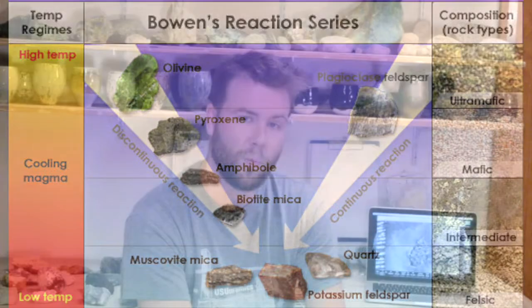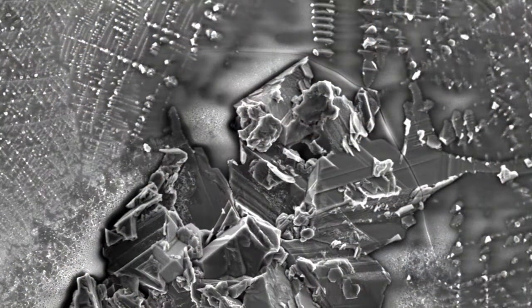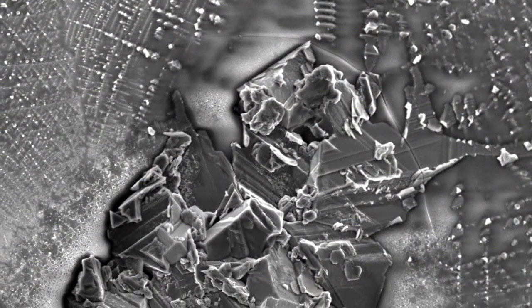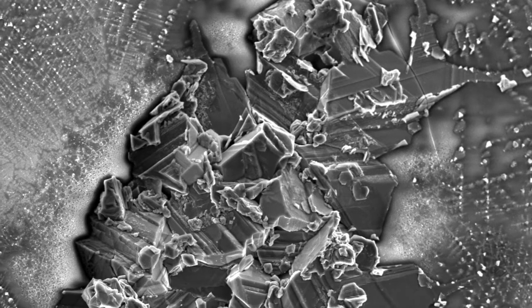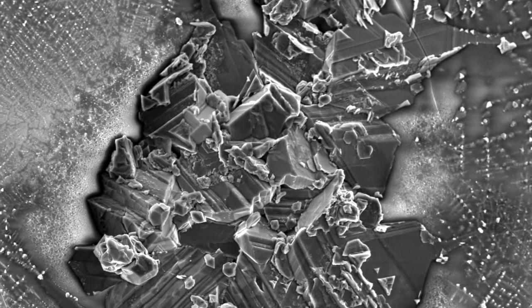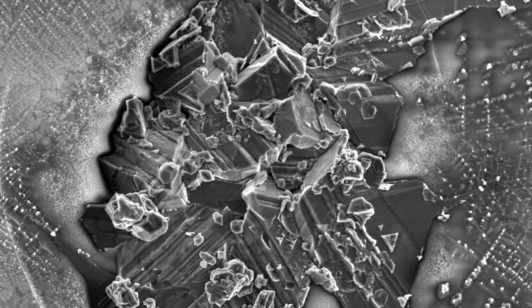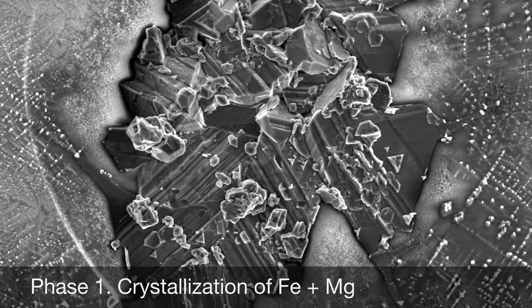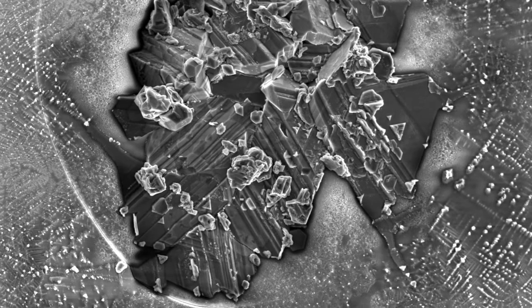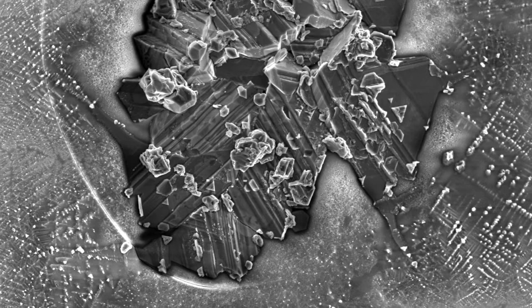And so that relates directly to this image because at the very center of our oil spots, we've got the highest concentrations of iron and, to a lesser extent, magnesium and manganese, and some other stuff. You know, we're almost never purely one thing. And so that's what crystallizes first, because it's all right there and it crystallizes very easily.